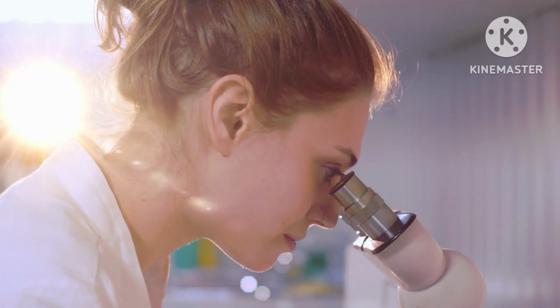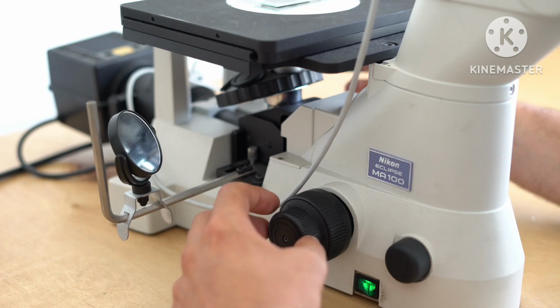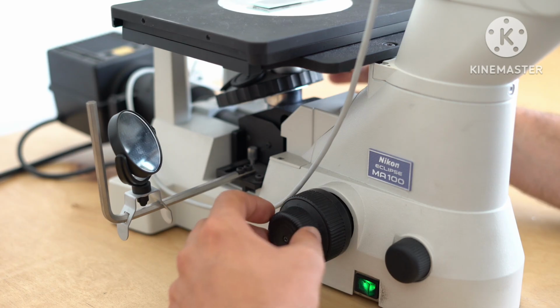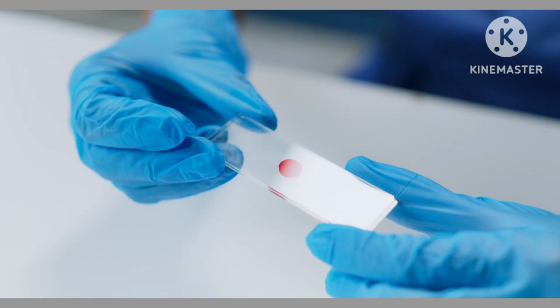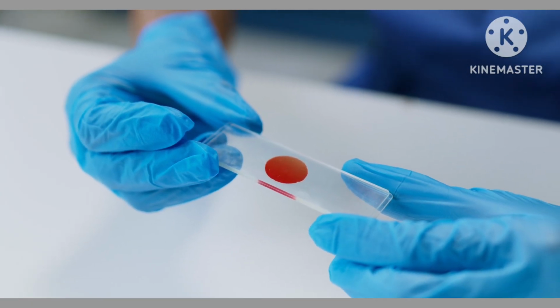A microscope is an instrument used to see very small objects clearly by making them appear larger. In simple words, it helps us observe things that are too tiny to be seen properly with the naked eye. For example, if I show you a blood smear slide, you cannot study red blood cells or white blood cells just by looking at it directly.